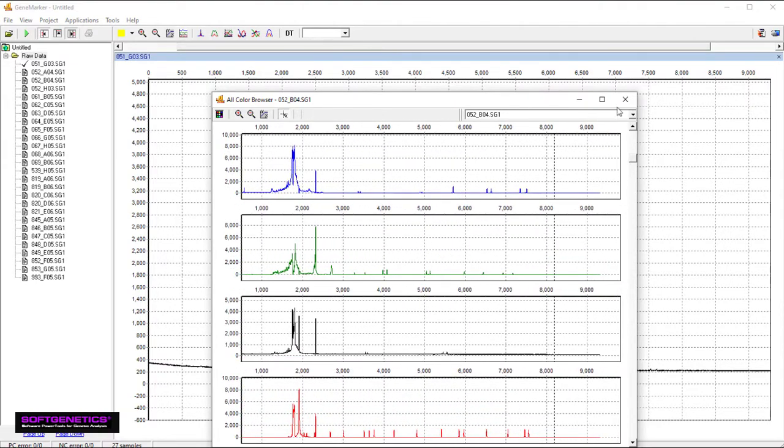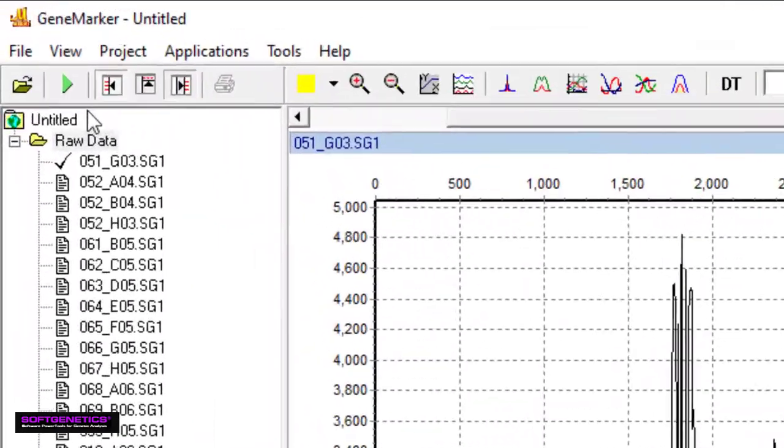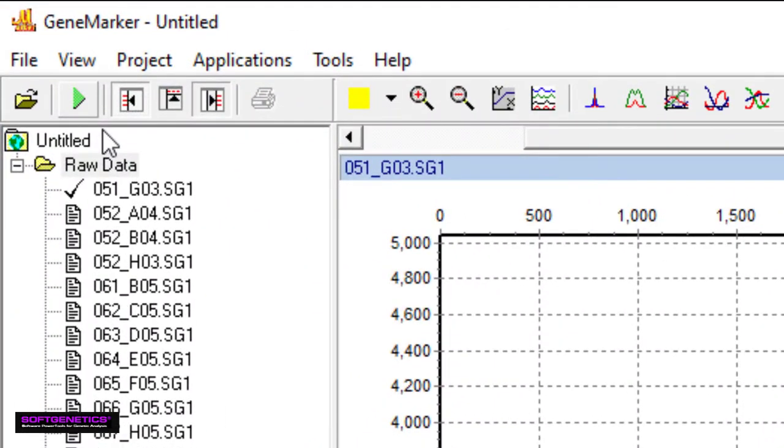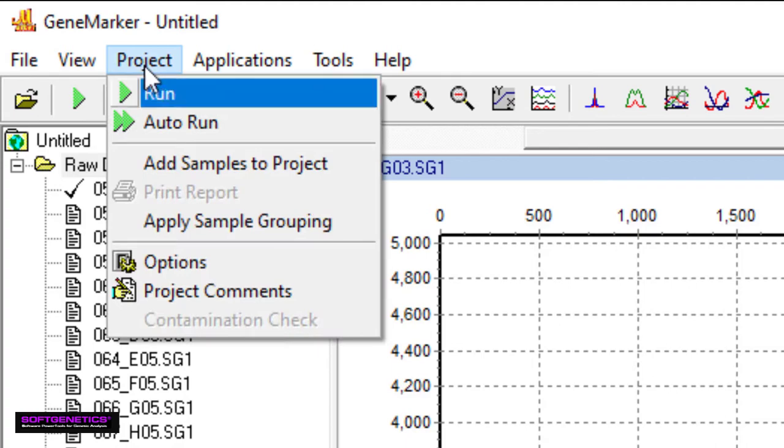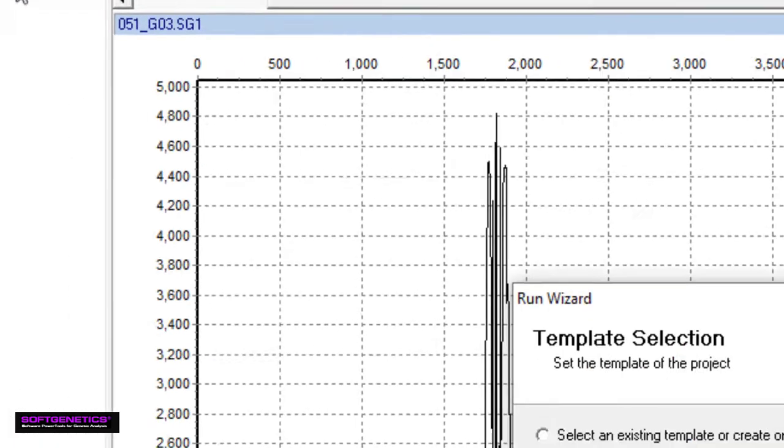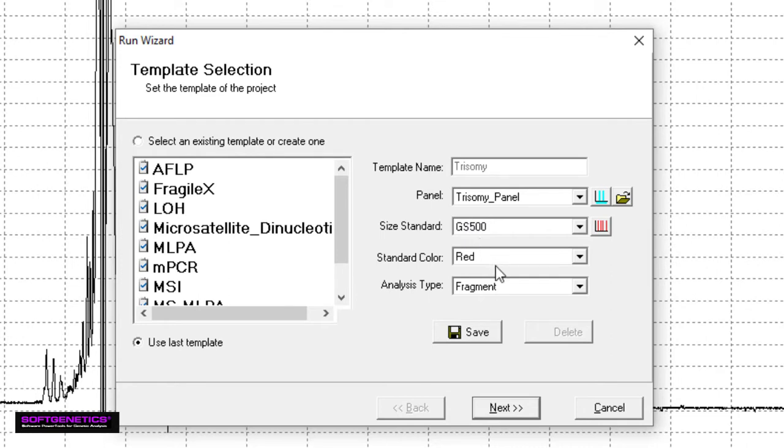Data processing is organized by a three-window run wizard. To access the run wizard, click the green arrow, or you can go to Project Run. In the first pane, you can select your panel if you have one, size standard, color, and analysis type. Click Next to get to the data processing screen.